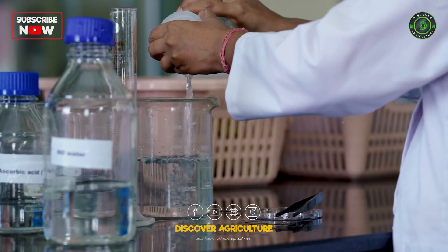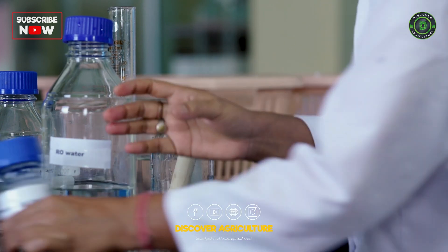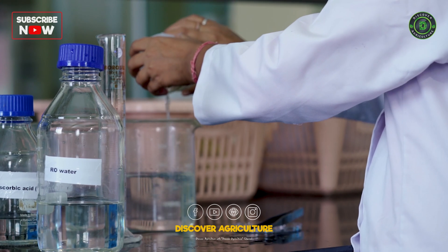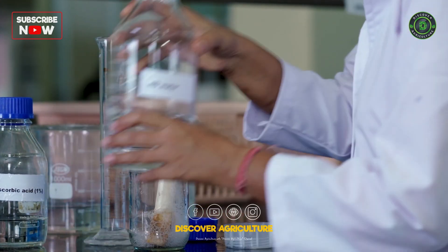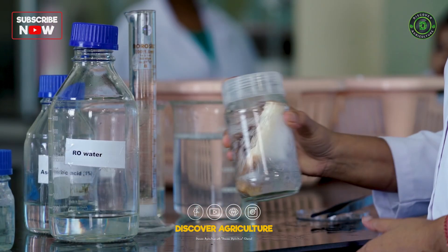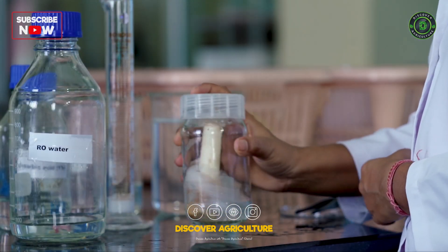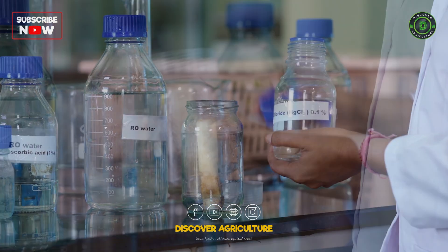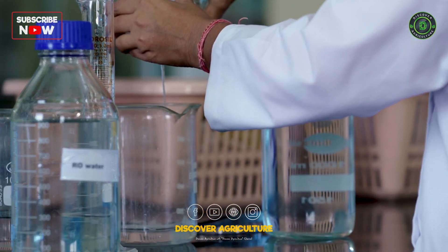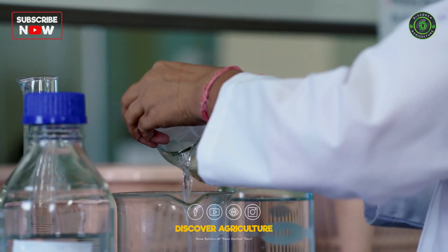Sterilizing the explant. To prevent contamination, we follow several sterilization steps. First, treat the explant with Tween 20 25% solution for 2-3 minutes. Tween 20 is a detergent that helps clean the explant. Wash the explant again 3 times with sterile water to remove any remaining detergent. Next, treat the explant with 70% ethanol for a few seconds, then rinse again with sterile water. Finally, we use a 0.1% mercury chloride solution to further sterilize the explant for 1 minute. Wash the explant 3 times with sterile water to ensure no residue remains.